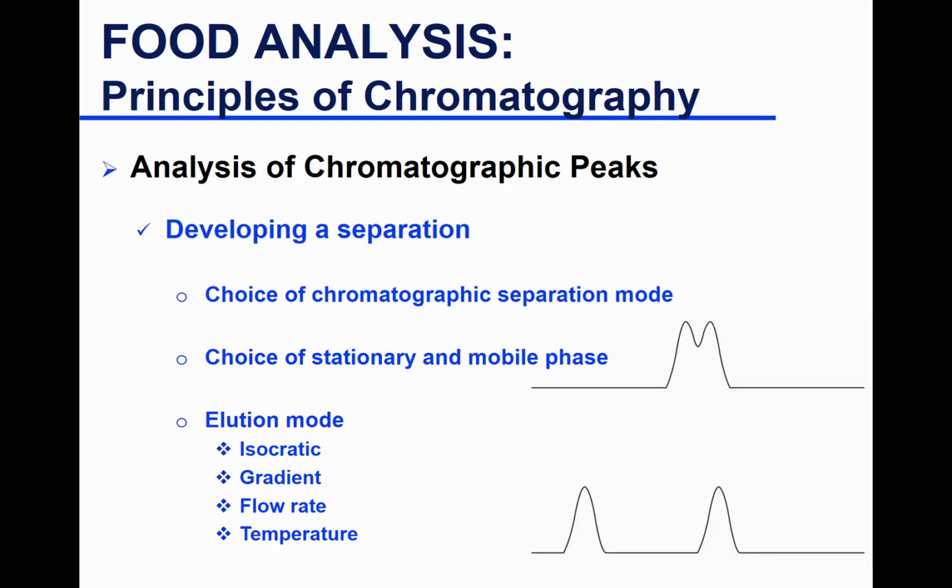Even if you chose reverse phase chromatography, there is a C8 column, C18 column, C30 column, C40 column. You go, oh my gosh, now what do I need? Which one do I need, C18 or C40? By the way, which would be more hydrophobic, the C18 or the C40? C40 will be more hydrophobic because it has the largest hydrocarbon. The largest hydrocarbon is more hydrophobic.